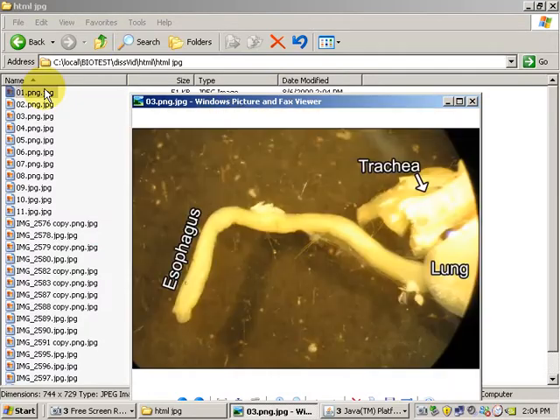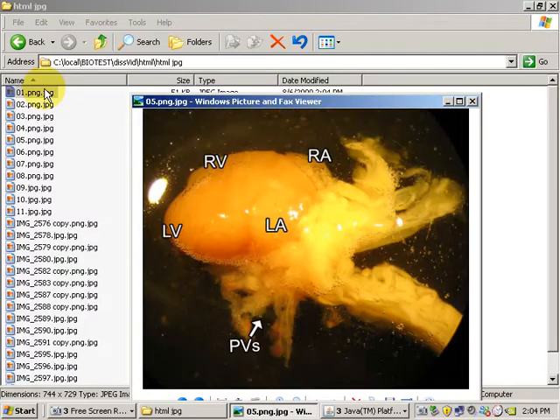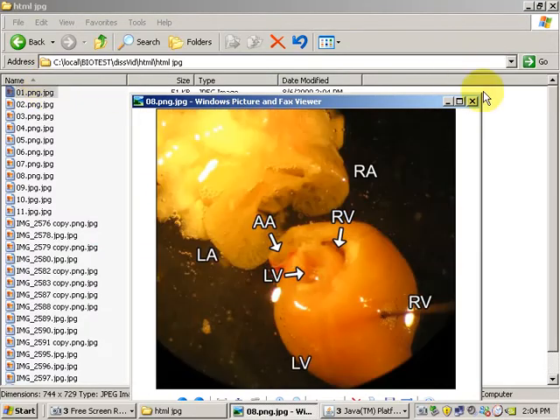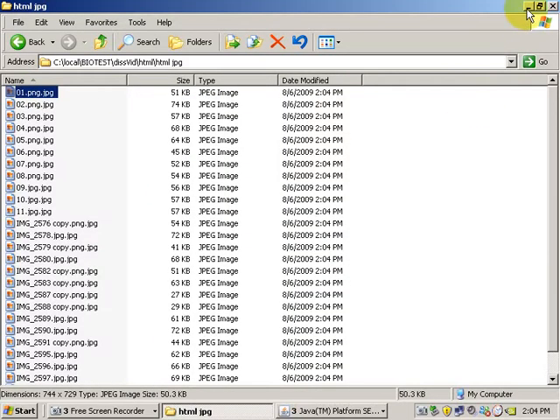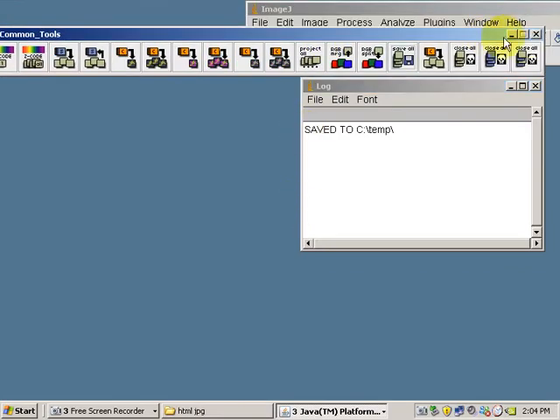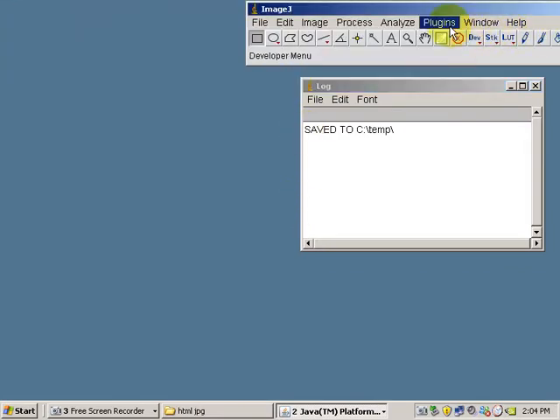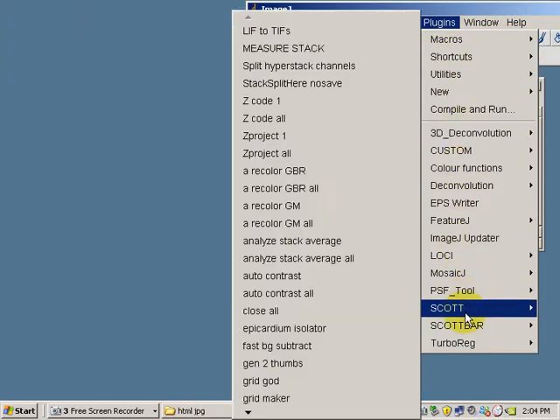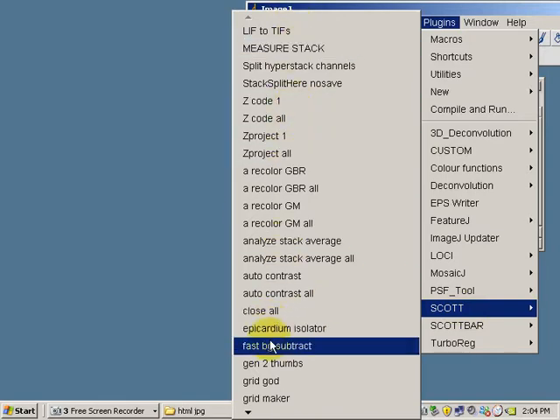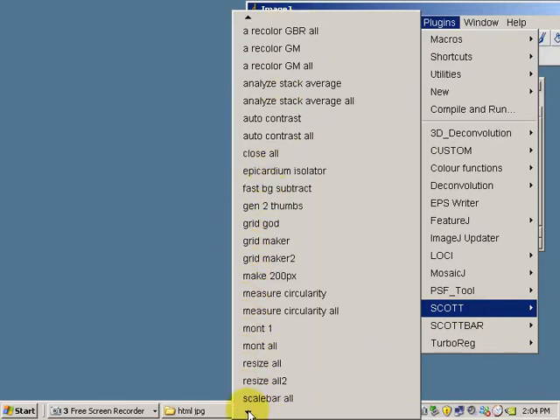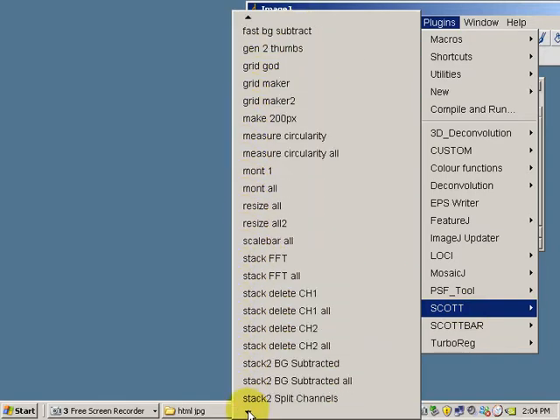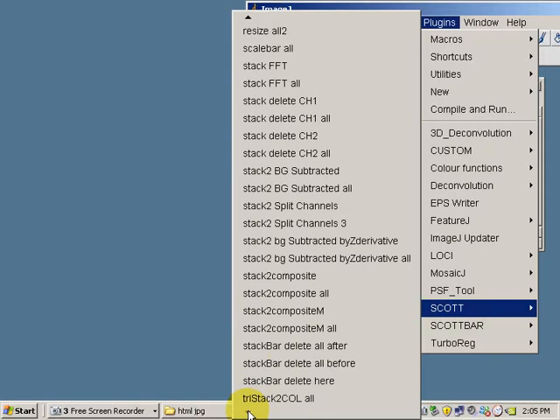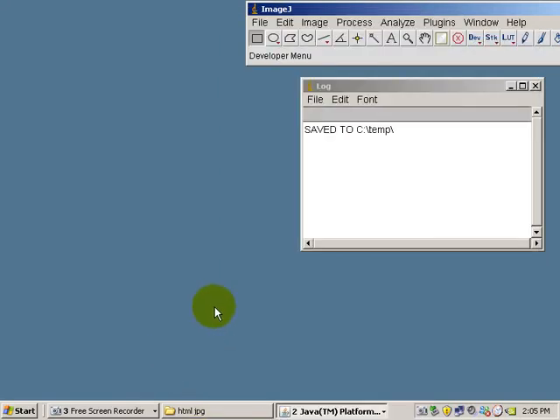Now there are a large collection of scripts in that Macros folder. Most of them you can view by going to Plugins and Scott. You can see I wrote a lot of small scripts to do various things over the months that I worked here. So you can take a look and also learn how to write your own. And it can be very helpful.